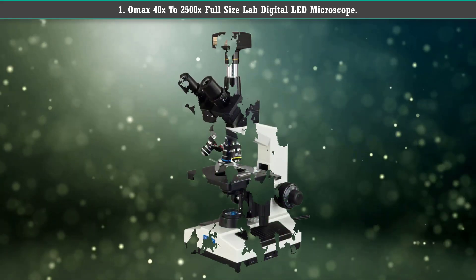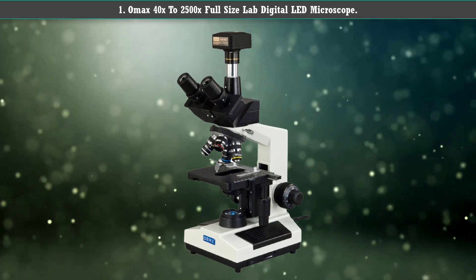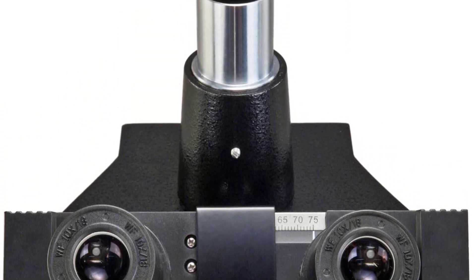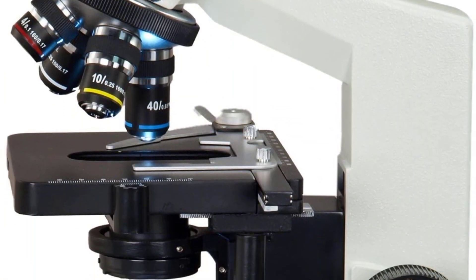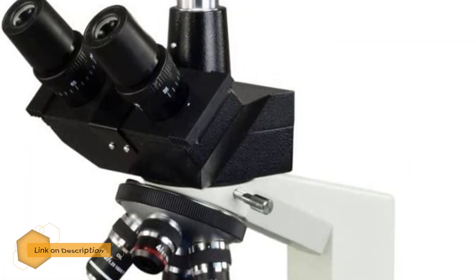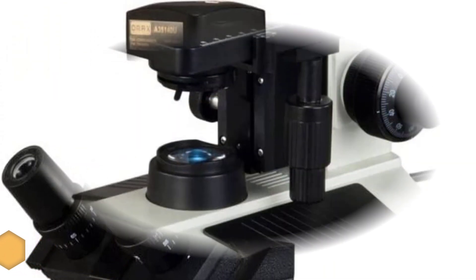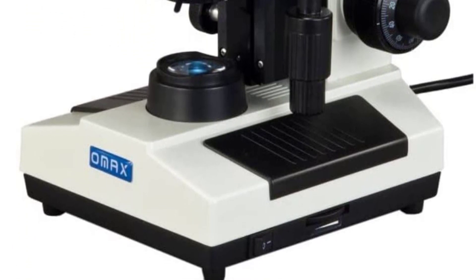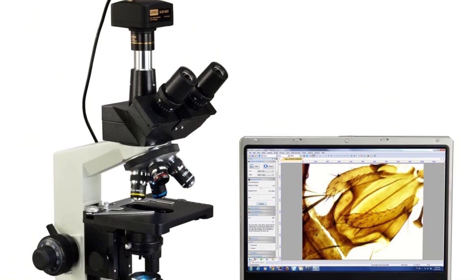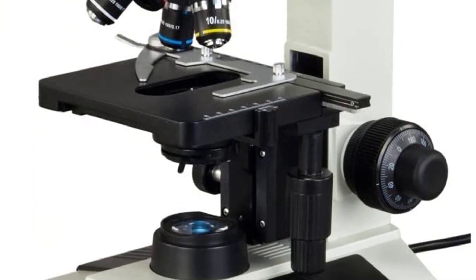Number 1: Omax 40x to 2500x Full Size Lab Digital LED Microscope. First on this list is the Omax Full Size Lab Digital LED Microscope with an impressive magnification range of 40x to 2500x. It's a modified compound microscope, hence the high magnification, that allows you to study various types of translucent and opaque specimens. This microscope is easy to use, versatile, and features excellent optics and precise controls.